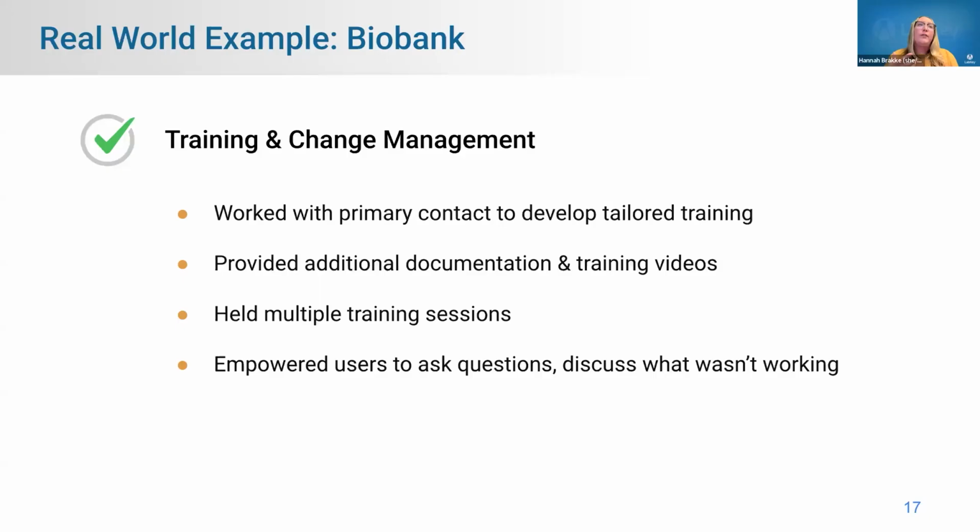And so the last one, for the training and change management, we worked with that primary LIMS champion to help develop a tailored training. So instead of providing either an out-of-the-box training or forcing the client to do their own training, we worked very closely with them to develop a tailored training plan of what are the best things that we want to make sure that the users get trained on first, and then how deep we wanted to go for each of those.